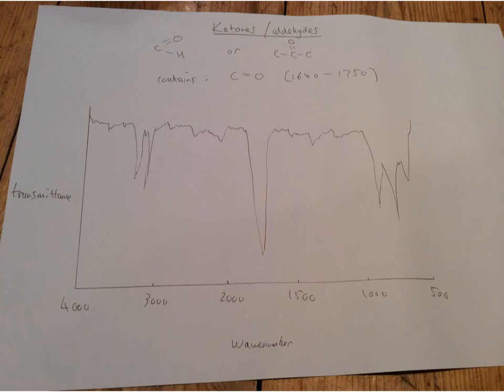Again, notice we've got some peaks at 1000 to 500. Just ignore them, that's just the fingerprint region. So, about 5 more minutes left, guys, off we go. And this is the last one.